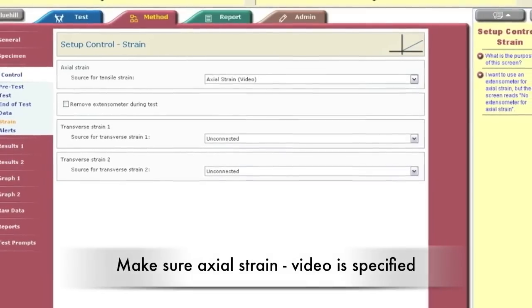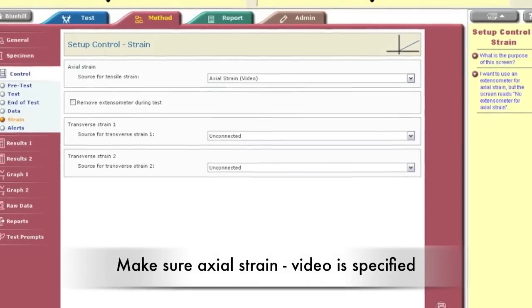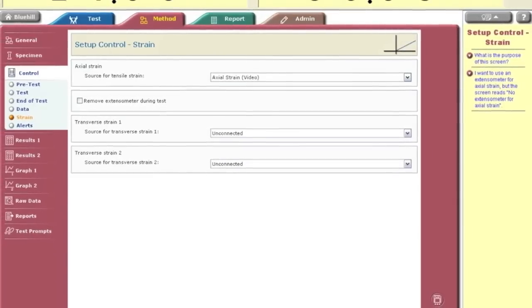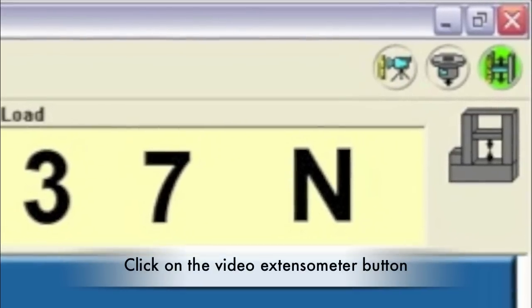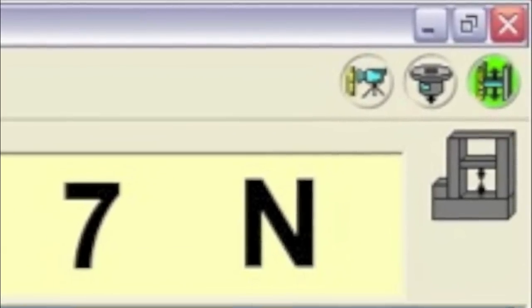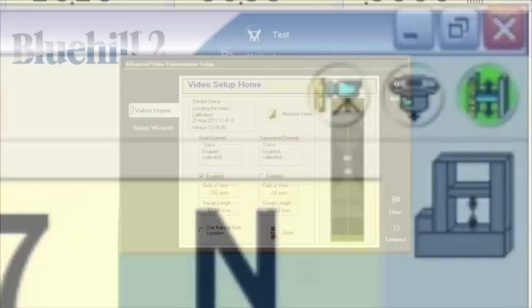In the method tab under the control menu, click on strain and specify that the axial strain is measured by video. Click the video button in the top right corner. Click enable under the axial channel, telling the software to measure the strain in the vertical direction.